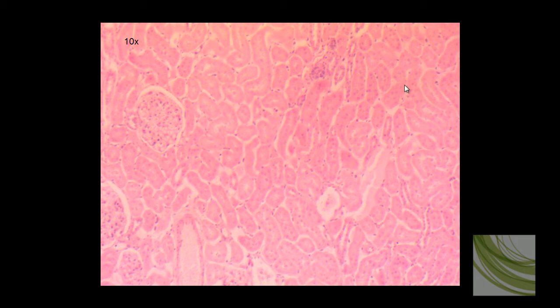Now that we're at the 10X objective on this slide, we can see some of the little tubes that are lined with simple cuboidal epithelial tissue. There's a glomerulus and another glomerulus, and we can see a lot of these little tubes all packed tightly together.